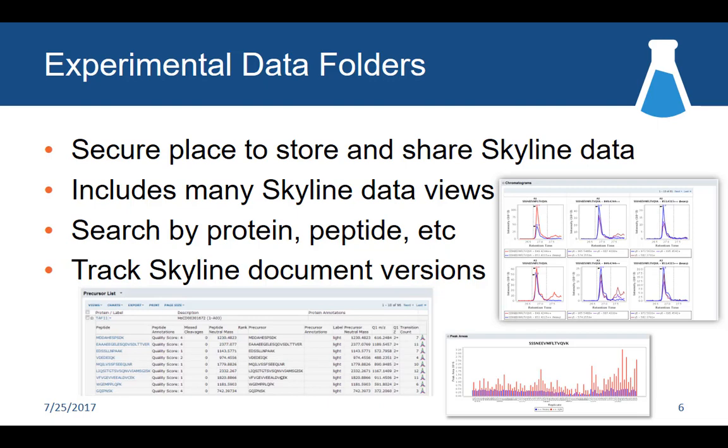So you don't just have, say, a bunch of files with V1, V2, V3 on them. In Panorama, it'll actually link those together automatically and let you see version 1 and version 2. And then we're looking to add some additional capabilities to help compare those different versions side by side, so you can see, okay, what actually changed between 3 and 4, or 3 and 10, as you curated and developed that.